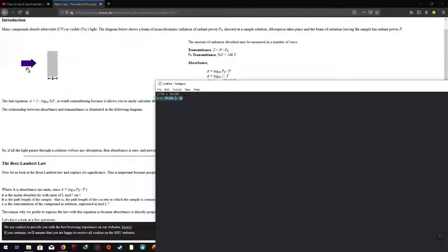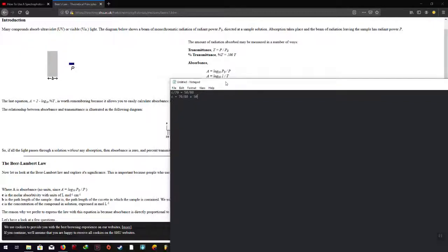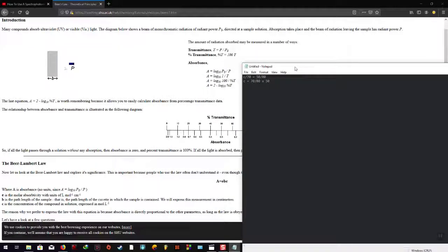This is the most recurrent formula. We could use it always. We must use it after the end of the reading of the spectrophotometer, and from this formula we could calculate the concentration of the sample by dividing the absorbance of the sample by the absorbance of the standard, times the concentration of the standard, and from this we could get the concentration. And here is an example of how we could calculate the concentration of the sample.